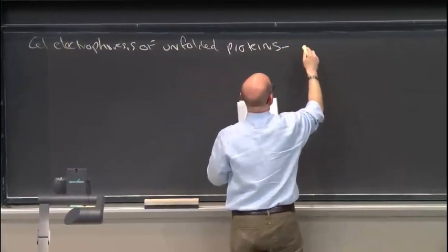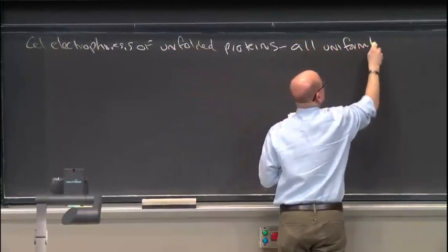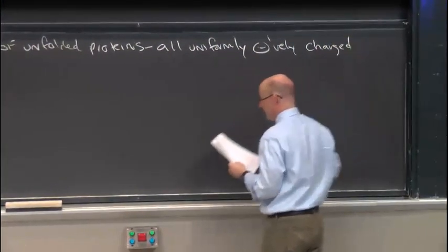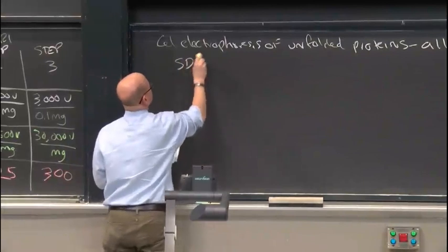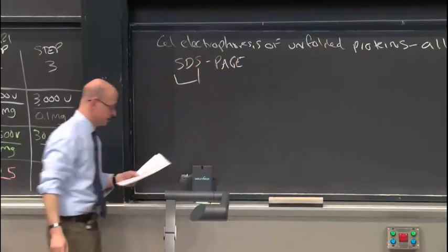All of which are uniformly negatively charged. Okay, and to do that, we're going to use a technique known as SDS page. We'll talk about both parts of this in a minute. SDS page. Let's talk about this SDS.